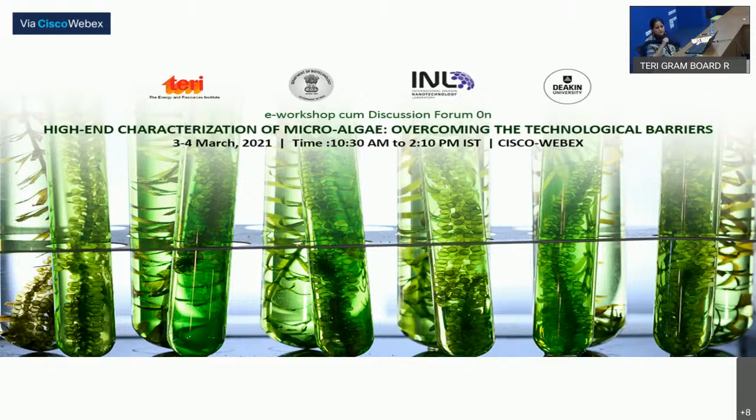So what you need to do is first acclimatize your isolate, which is in the lab condition, to the condition where you want to cultivate. So you need to transfer that 15-liter can to the outdoor reactor system in order to acclimatize your strain to the outdoor condition, and then you can transfer into the 300-liter or 1000-liter reactor systems.